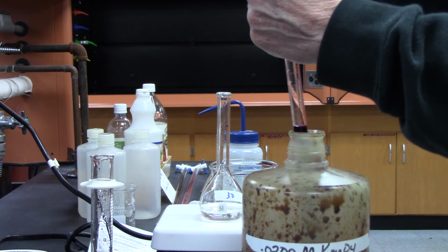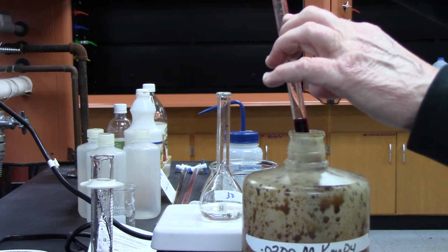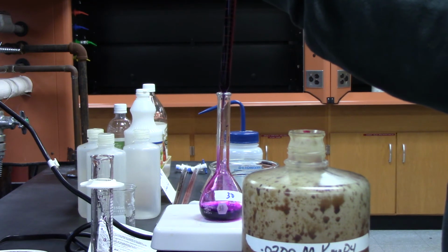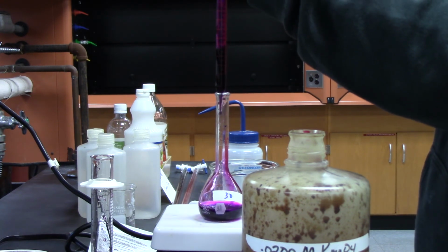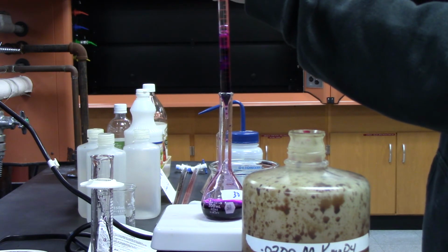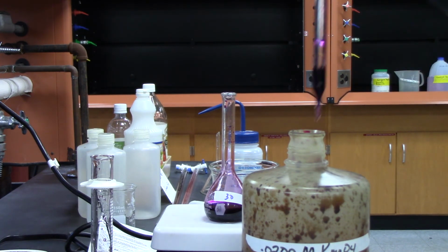So I'm bringing it up to where it says 10. If I brought it all the way to the top, it says 0, but that's actually 25. So I'm bringing it up to 10 because that's 10 less than 25, or 15. Oh boy. Okay, there we go.